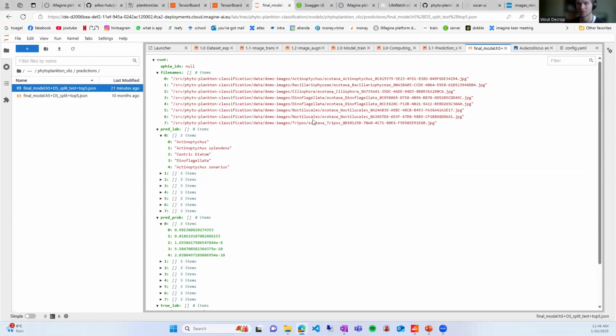I've not made a notebook about this. The notebooks are just about doing the predictions. But then to look at the specific sample and say it's 80%, like what the distribution of the classes is within that sample, at the end, you kind of have to do it yourself, because the model says which classes it thinks are there, but then you can just export the JSON file and then look at the top 1 class and the distribution of this.